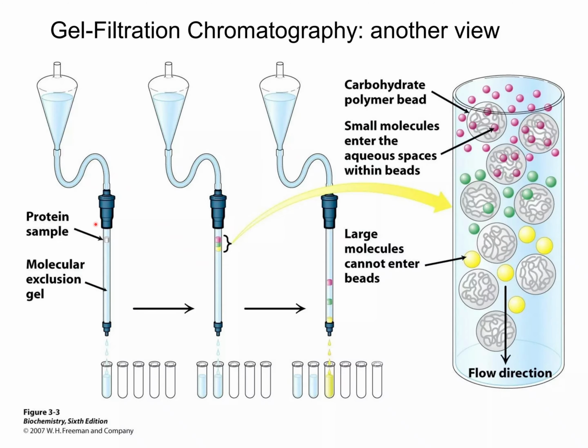Another view has been shown here. You can easily understand that larger molecules are just bypassing the pores, but the smaller molecules are getting retained and going through the pores, so they take a longer time.